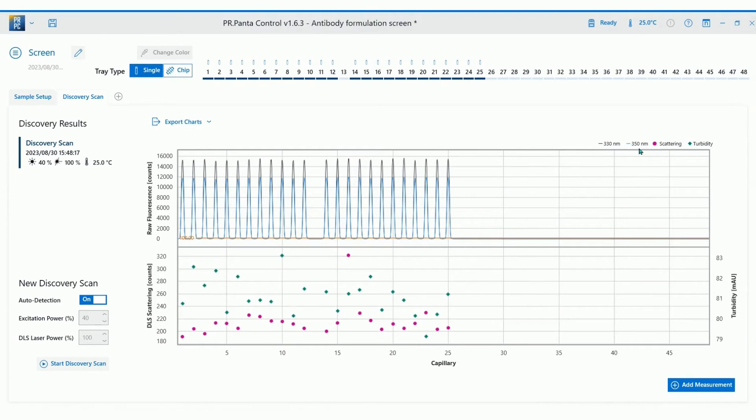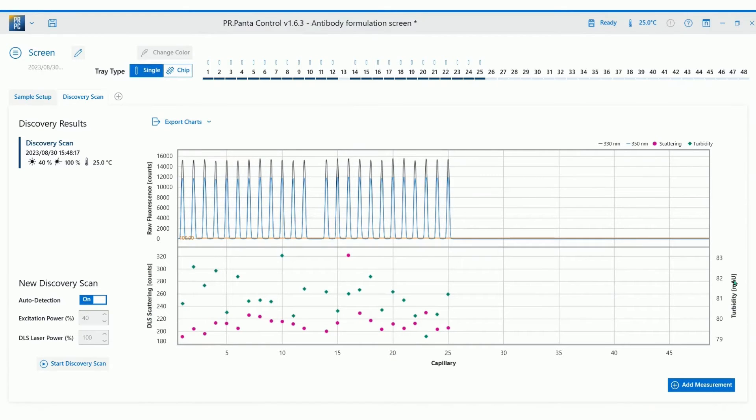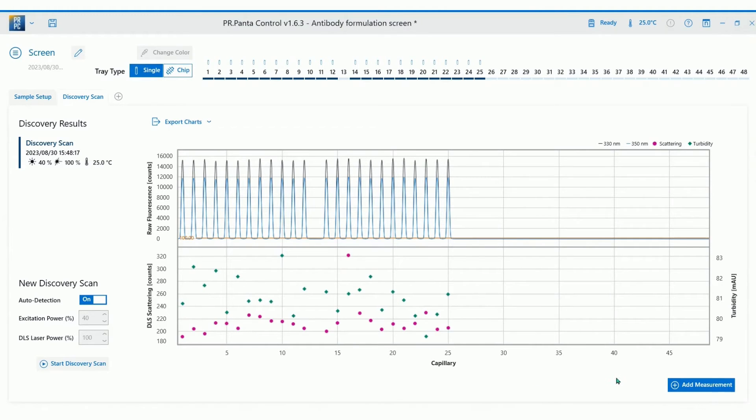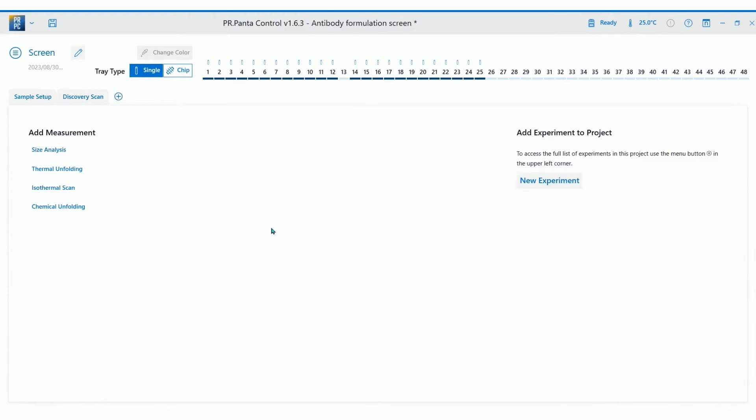In addition, the scattering signal from light scattering optics and the turbidity signal from the back reflection optics are displayed in a separate graph at the bottom for each capillary. Now you're ready to add different types of stability measurements. Click on add measurement.